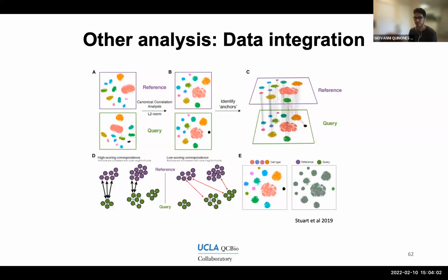Like my tool does this, my tool does this other thing. So it's virtually impossible to keep up with everything. So I just wanted to very quickly mention what other types of analysis people are doing, just so you have an idea and you know that these things exist. The first one, and this is also going back to, I believe somebody asked about this on the first day of our workshop, about data integration.